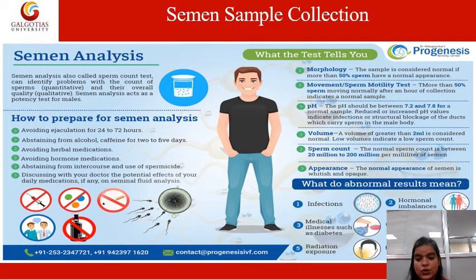Always make sure to wash your hands, do the collection properly, give enough time for the collection, and make sure your identification is on that container, and the container should be sterilized enough to give you the sample.